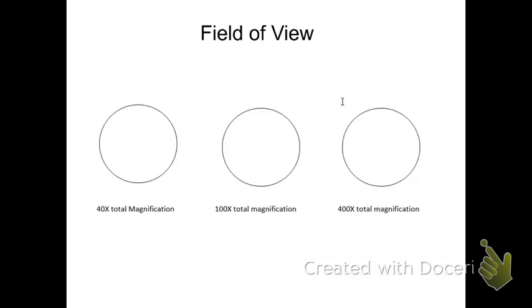Okay, the last portion of this lab is an exercise using your microscope. It's called the field of view. You have a handout in your lab folder that goes over this with you. Read through that, and let me introduce this for you briefly, and then your instructor can help you with this as well. At the end of this worksheet, there are 2 pages of problems for you to work through, and the answers are all posted for you as well in the Blackboard shell.